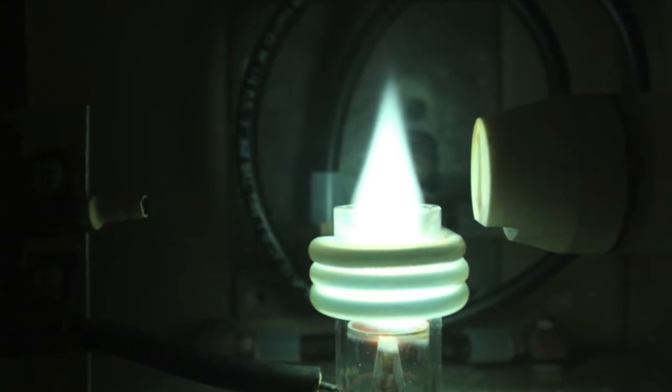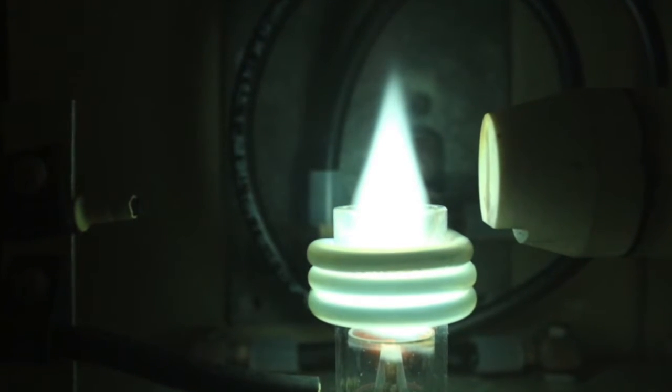Now the torch assembly breaks down the water sample into atoms. It accomplishes this through argon plasma. What is plasma, you ask? Well, plasma is a gas that has been heated to extremely high temperatures, approximately 12,000 degrees Fahrenheit, at which point electrons fly off the atoms.